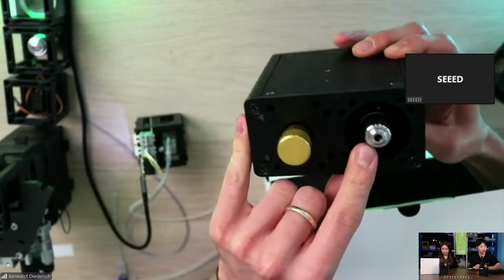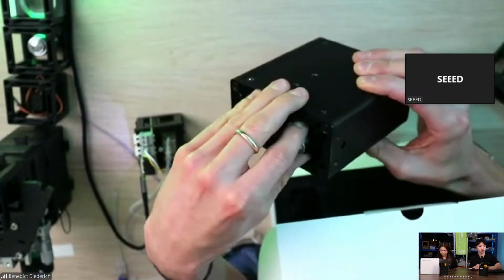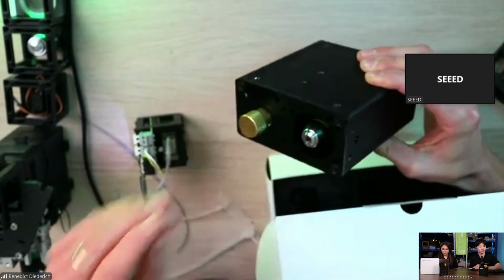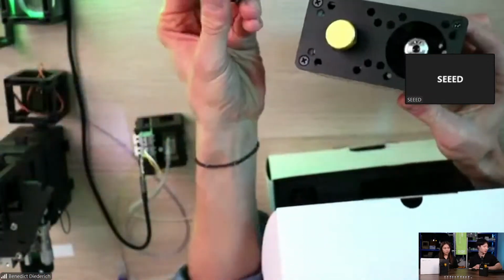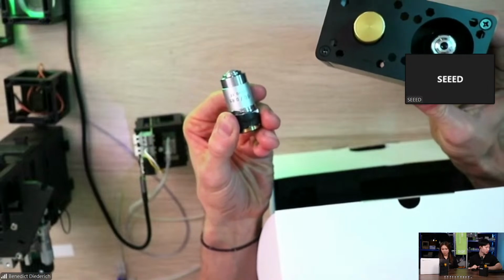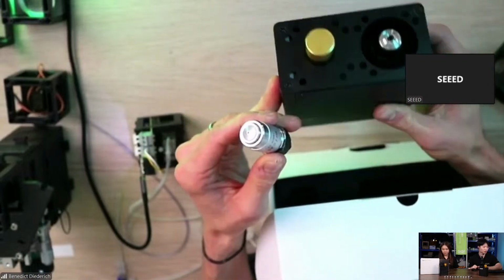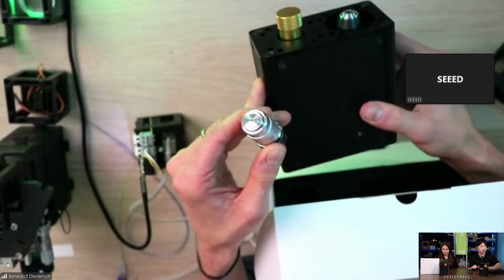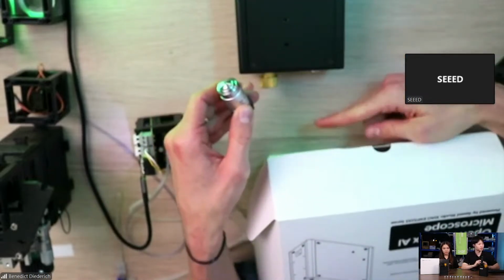You probably know that from biology, where you can actually unscrew it here. And then you have something, well, I prepared that already, looking like this here. This is necessary in order to magnify whatever you have under the microscope. So it looks a bit different from what you probably know from microscopy, because you have the sample here and you look from below.